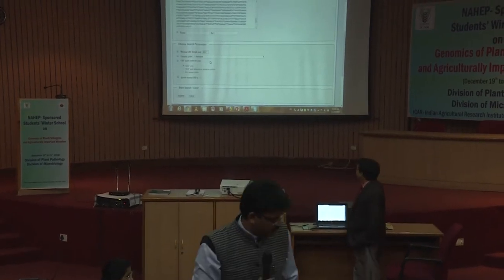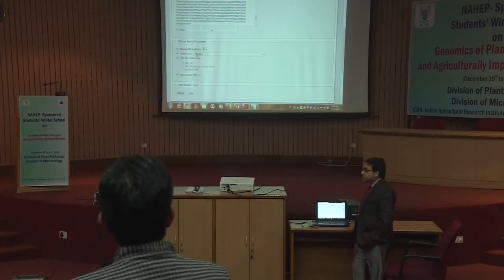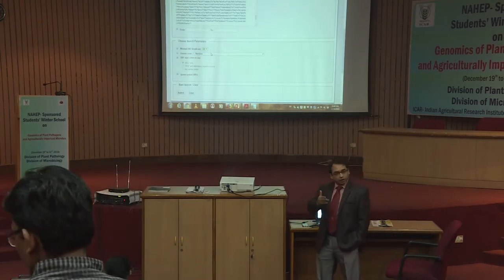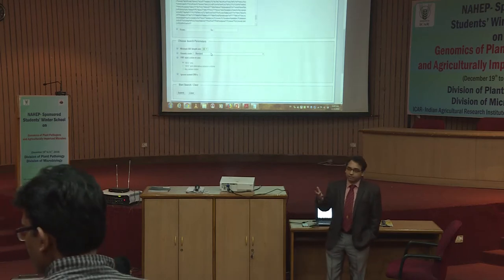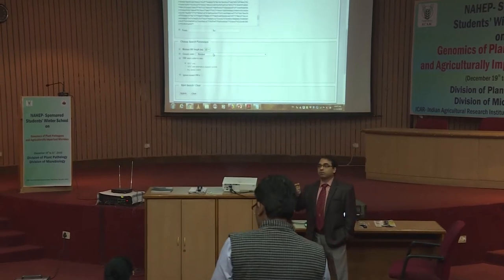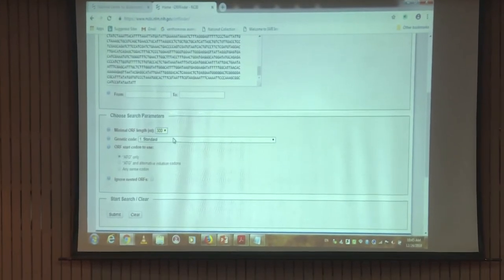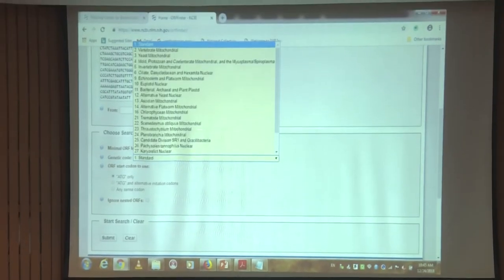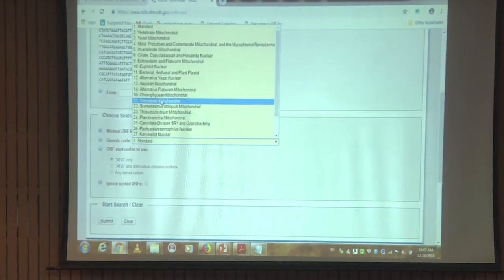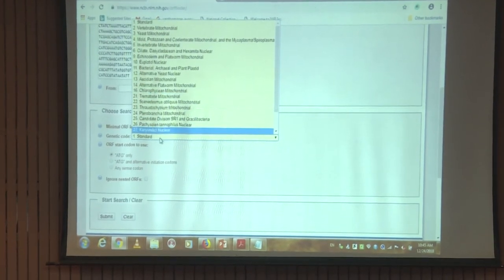Okay? So, you can give it 100, and then for the genetic code, generally we use standard. But if you are doing something, for example, mitochondrial DNA of some organism or bacteria, then you have to use the particular codon table which is specially used by that organism. But normally we give standard. Besides that, there are several other types for other organisms. You can choose as per the sequence you are handling. But normally we use the standard.